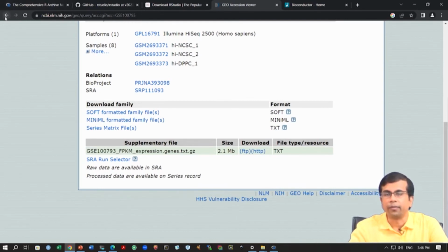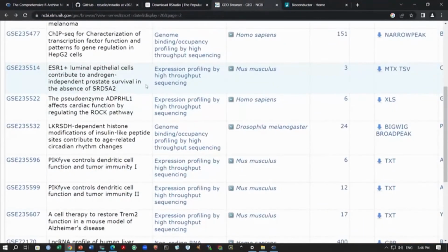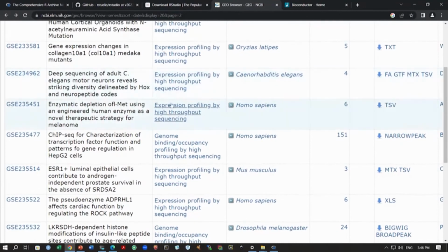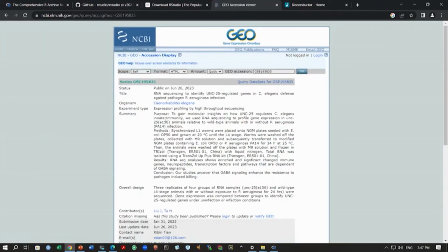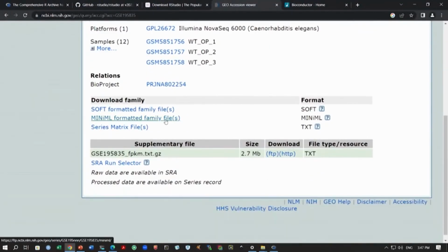Depending on the type of analysis that you want to do, what I will suggest is that you should try to download raw count data, because we will go through the differential expression analysis. And when you want to go through the differential expression analysis, we will use the DESeq2 platform, which only takes raw count data. It does its own normalization before it does this differential expression analysis.